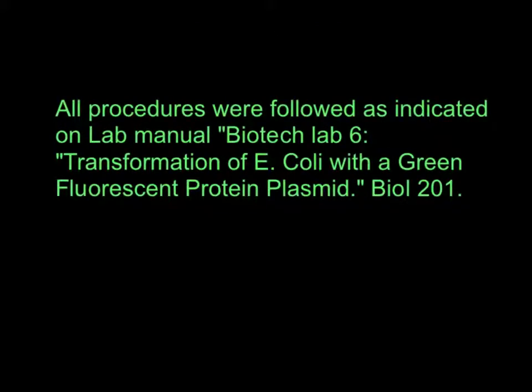All procedures were followed as indicated in the lab manual, Biotech Lab 6, Transformation of E. coli with Green Fluorescent Protein Plasmid, Bio 201.